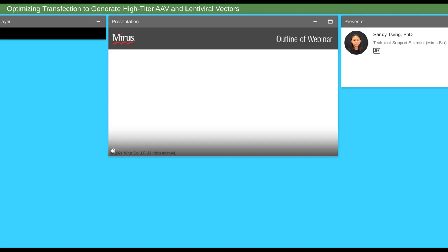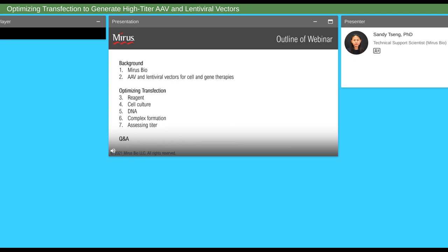First, I want to give a little background on Mirus Bio for those of you who aren't familiar with us. I also want to touch on how these viral vectors, AAV and lentivirus, are being used for cell and gene therapies. Then I'll focus on how at Mirus we've examined ways to maximize AAV and lentiviral titers through optimizing parameters that surround transfection. I'll be touching on these parameters one after the other, and I'll end with a Q&A if you're watching this live.